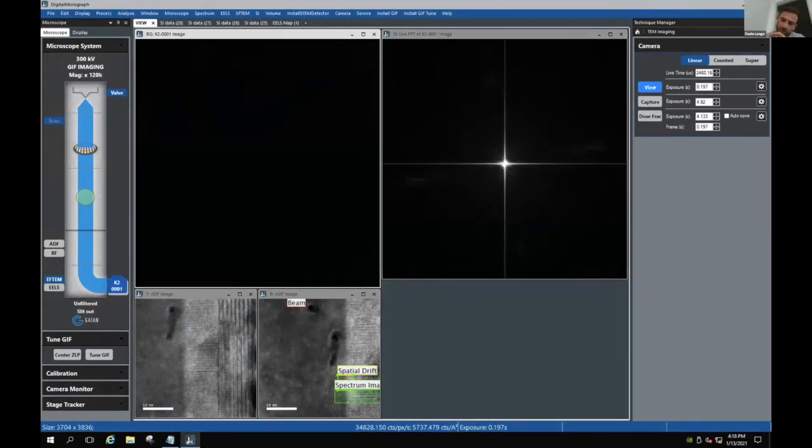So what we're doing now, this is not something that you want to... You would destroy your MOF right away by doing that. Agreed, but right now I haven't found the sample yet. So I would like this. I'm just trying to see where the sample is. How should we do this?